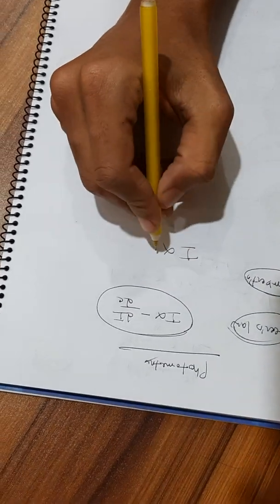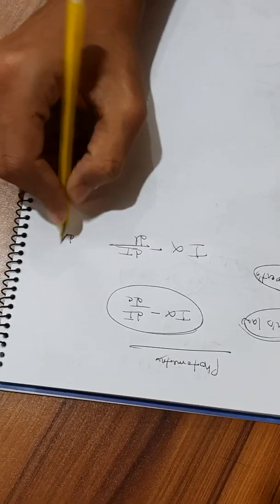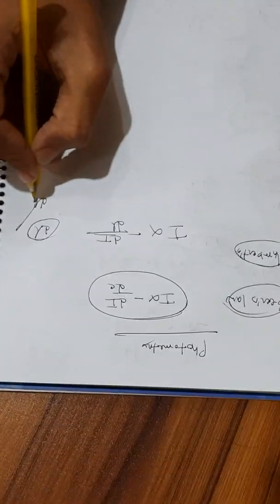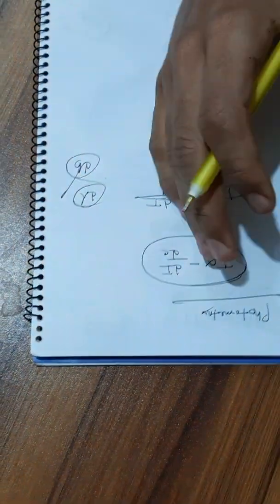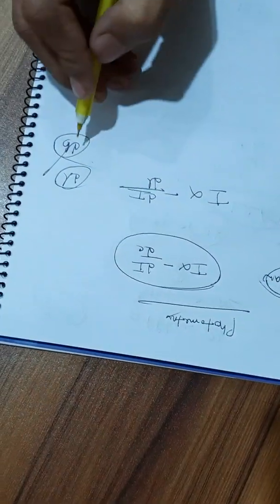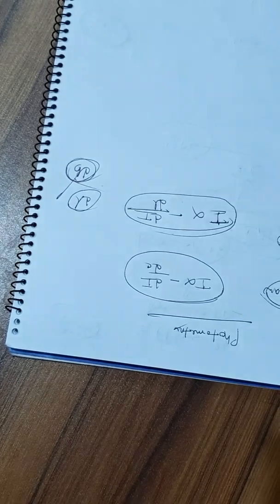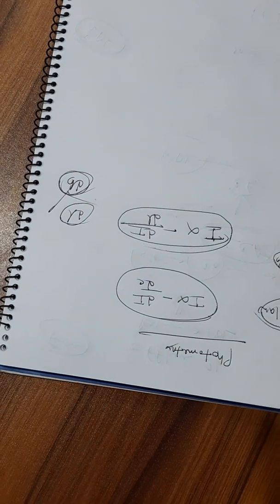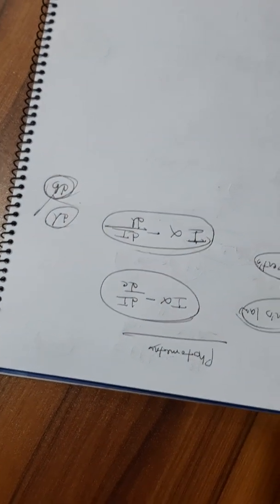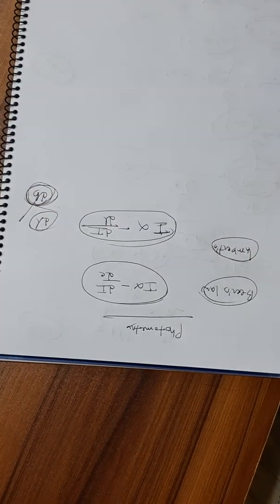And from Lambert's law, I is proportional to minus dI/dL or dB. Here dL or dB is the depth or thickness of the solution. The light pathway is dB. Here from Lambert's law, I is proportional to dL. That means the intensity or absorbance of the light is proportional to the total pathway of the light or the thickness of the concentrated solution.